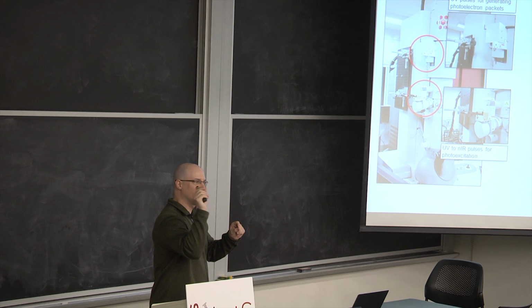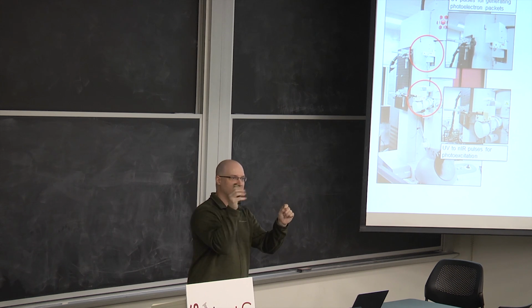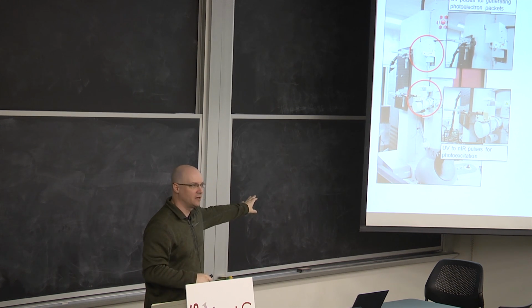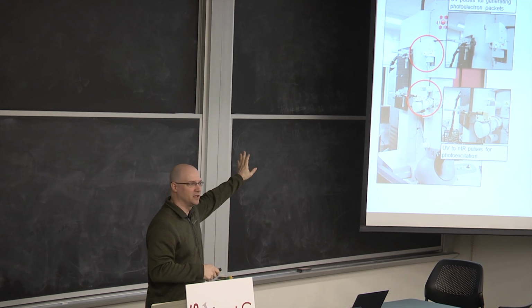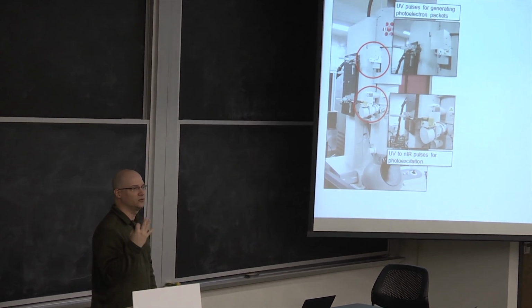Now I've got this pulsed source. I can set up the frequency. I can excite the material. There's some wagon wheel thing going on in there, right? And I can probe it just like that. And just like that, I don't have to rely on this camera anymore. I don't care about it. It can be the slowest camera ever made. In fact, it could be photographic film. Doesn't matter to me, right? What it means is that the time resolution now is dictated only by the laser pulse duration.